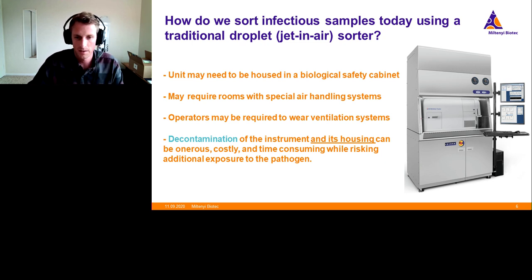These cabinets also will have specialized air handling systems or aerosol capture systems. Operators themselves can be required to wear ventilation systems. This is something everybody's quite familiar with now. And really the part that always was more of a mystery to me is the decontamination of the instrument and the housing.